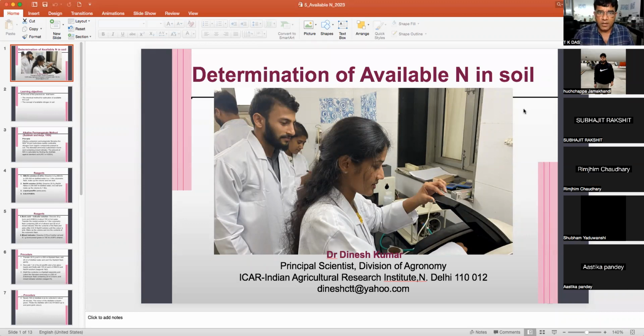This is a practical class and we are going to learn estimation of available nitrogen in soil. In the last practical, where we did total nitrogen in plant and soil samples, you must have clearly understood what is total soil nitrogen and what is available nitrogen.